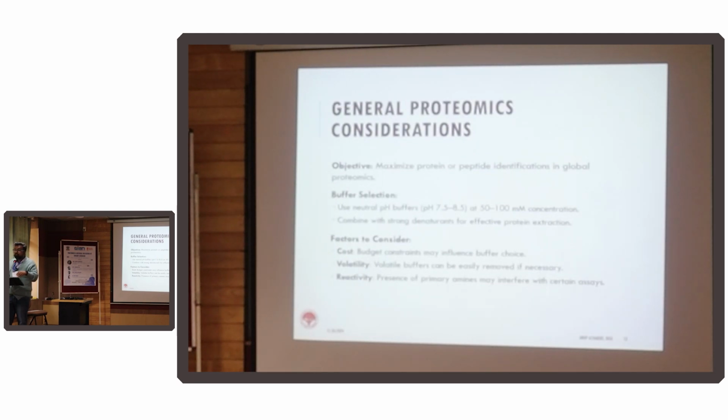One thing you need to always consider is cost. In any lab you go, because you will be doing this experiment for the next 4 to 5 years, funding might not be as smooth as it is today. Tomorrow you might run out of money, so don't go for anything that is very exorbitant and that you cannot continue for the long run.